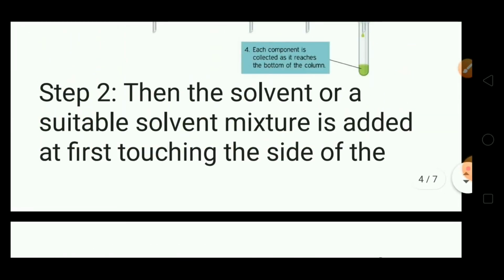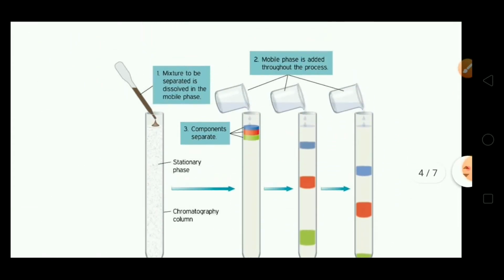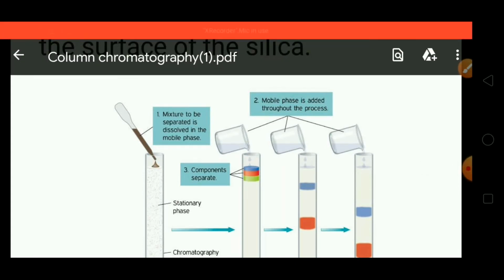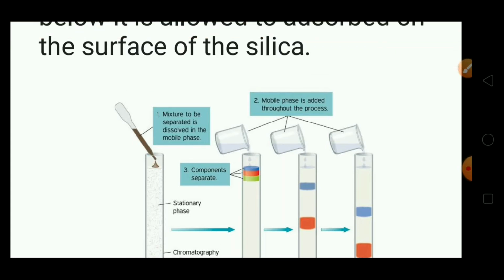You can see step 2. Mobile phase is added throughout the process as many times as needed.